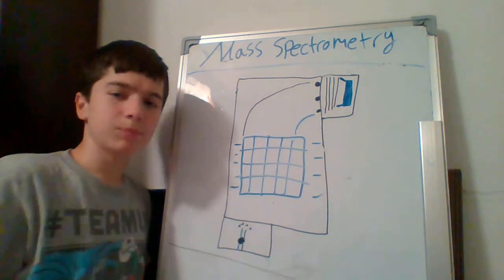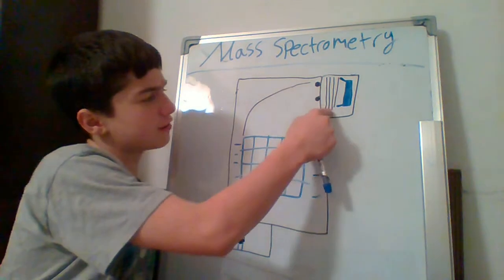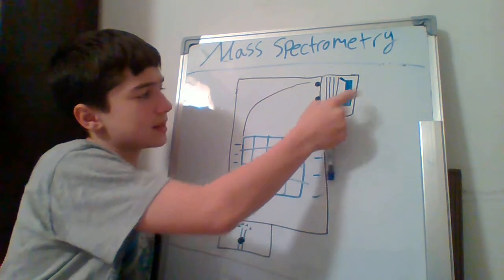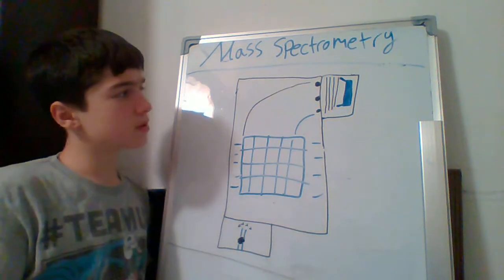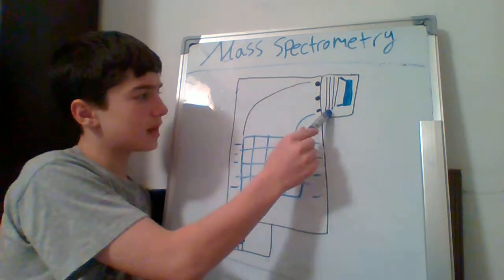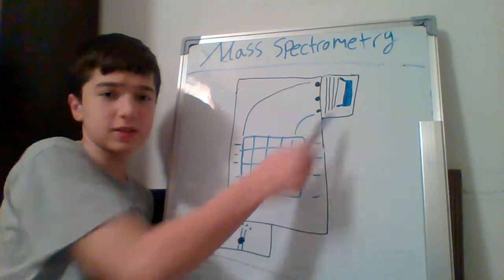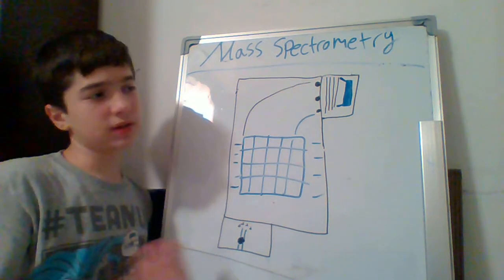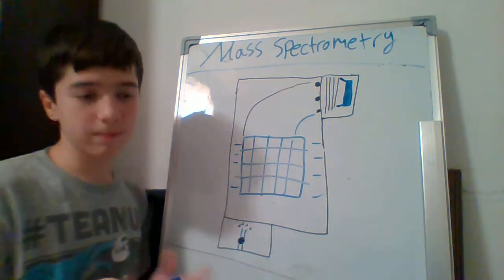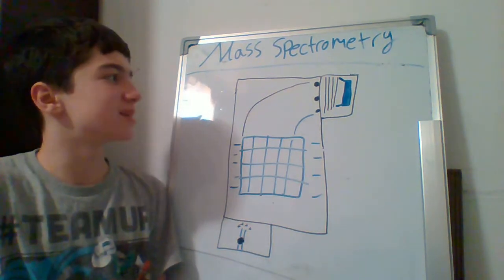The last part, detector. Can you guess what are the two parts? As you can see, we have some sort of sheets, and here something that's like a box. You're right. Those sheets are the electron multiplier. That one amplifies this part, and it tells us what? You're right. It gives us a signal, so it will go to the computer and we get all the analysis.